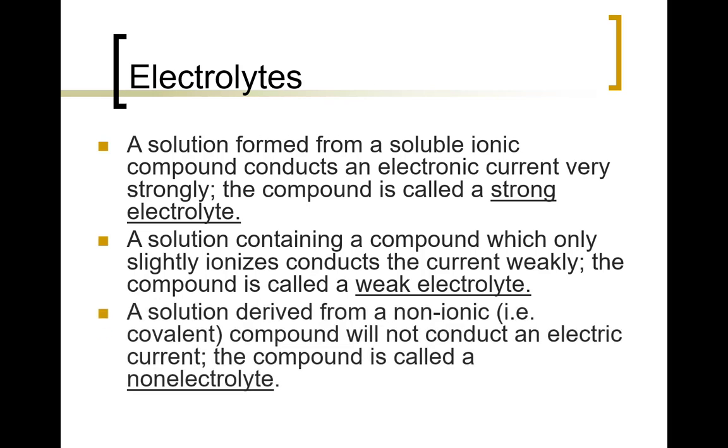And finally, non-ionic compounds do not break up into ions in most cases. And without ions being present, the solution cannot conduct an electric current. So as you might imagine, in our light bulb test that we described a second ago, we would see the light bulb remain completely dim. It would be unaffected when a solution is put between the two electrodes.